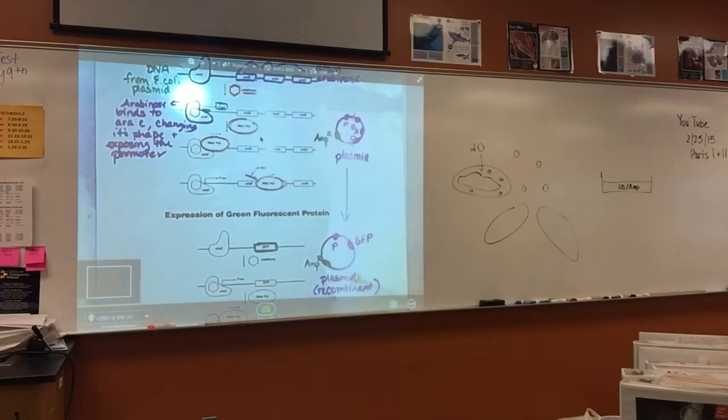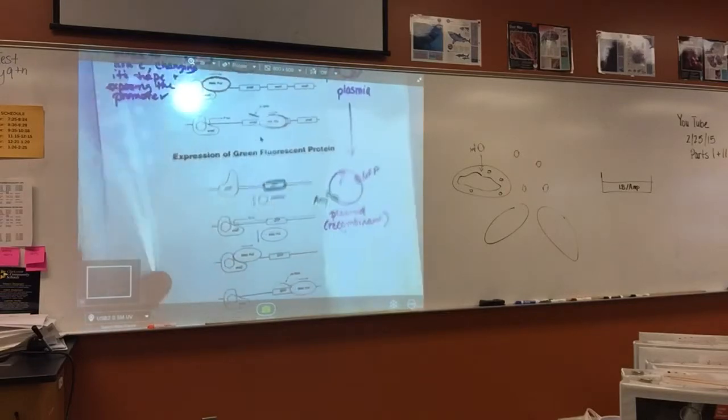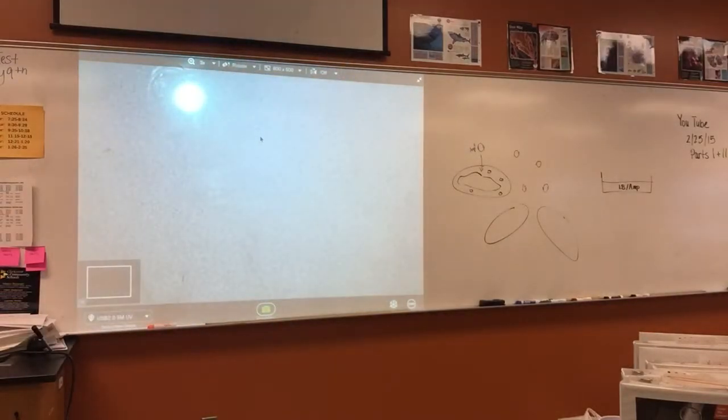So it's already recombinant because it already has the jellyfish gene in, okay? So that's that. So what we want to do is put this plasmid into our normal boring E. coli and make it cool so that it glows. All right, so that's the thing that we're gonna do. So the next little part here, that's the background information. I want to make sure everybody understands.